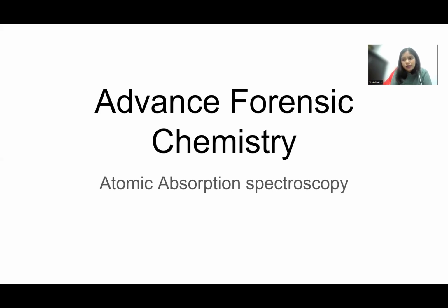So in the food industry, or to check the composition of a drug, or to determine the concentration of a particular element in cosmetics, or to see the mercury level in some XYZ cosmetic, we can use this technique, atomic absorption spectroscopy. Clear?